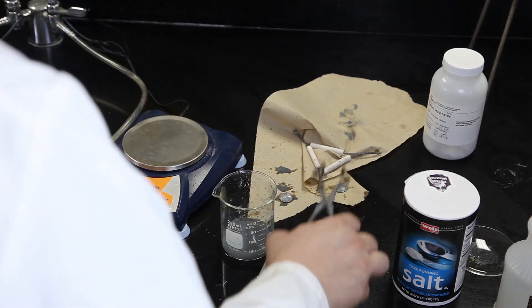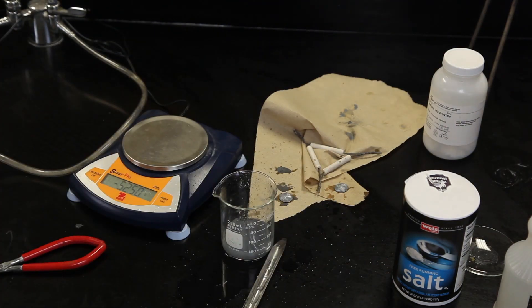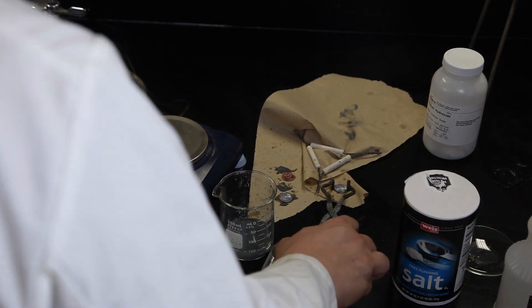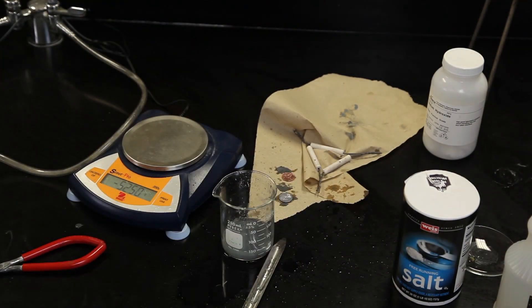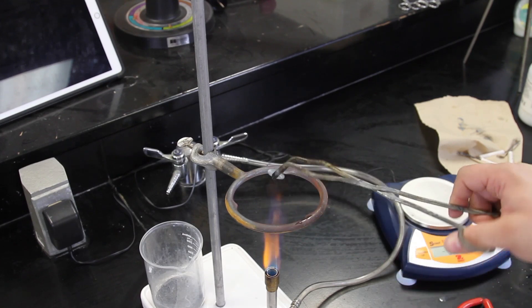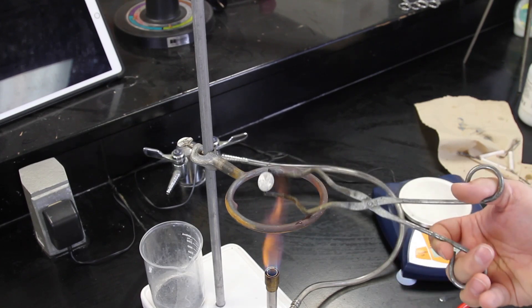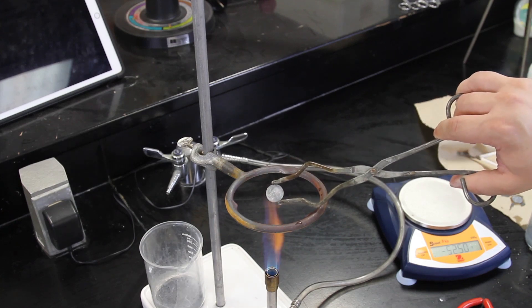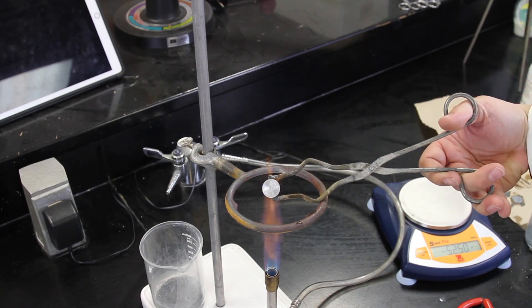Set one of the silver coins aside. Heat the other silver coin by holding it in the flame of a Bunsen burner or a torch. Keep rotating the coin from side to side and dipping it into the flame until you see the brass color begin to appear.